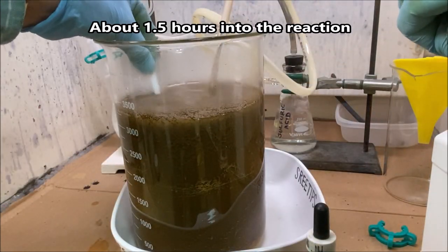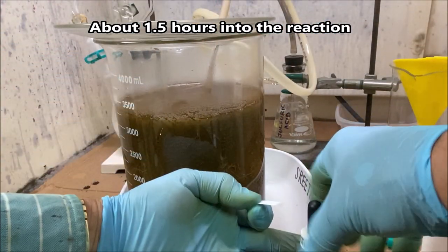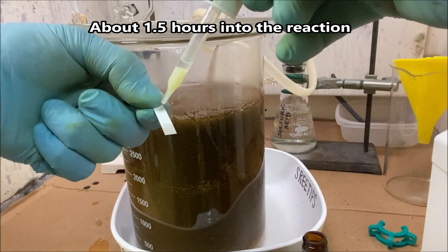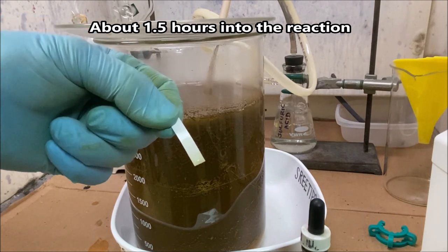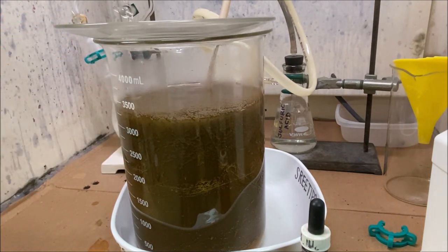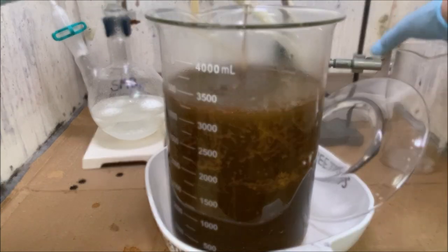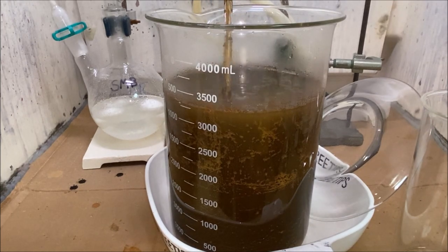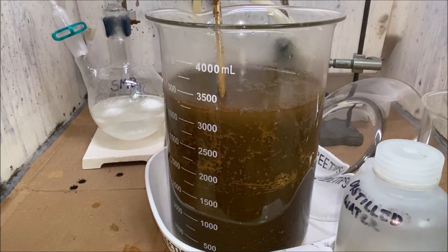I'm near the end here. I'm going to get a little bit of the solution on some filter paper and do a stannous test. Hallelujah. I think we're done, man. All the gold has been precipitated now. Then get our delivery tube out of here. It's heavy, it's encrusted with gold. See that? Let's see here.